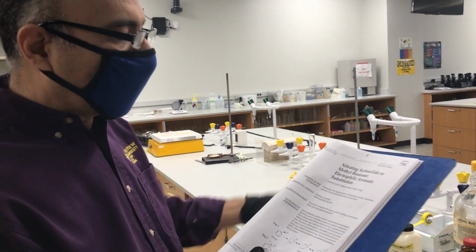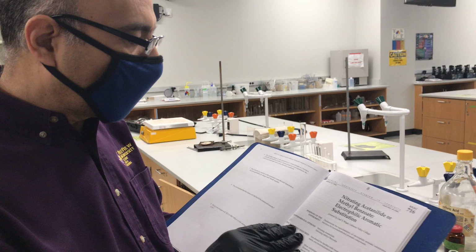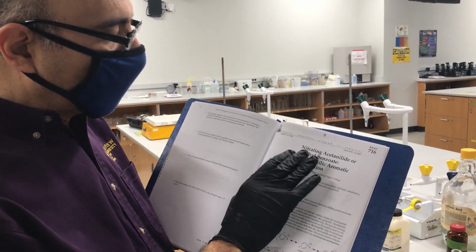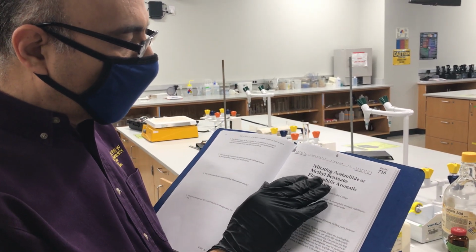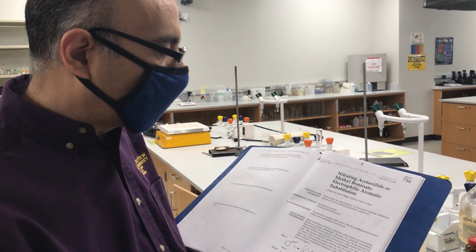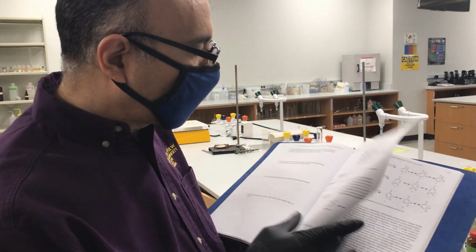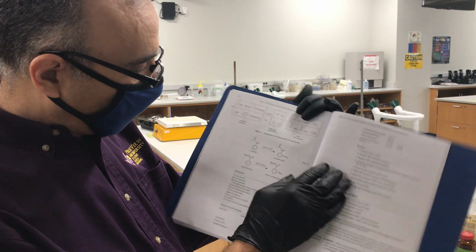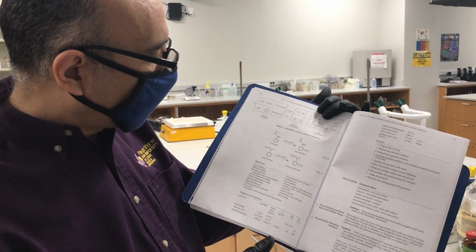So we are going to do the second experiment in chemistry 2 lab. We are going to talk about the nitration of acetanilide and methyl benzoate, and we are going to do nitration using nitronium ion. As you guys know, it is an electrophilic aromatic substitution reaction. This is the first part which we are going to do, and this is the second part. Let's start with the first part.